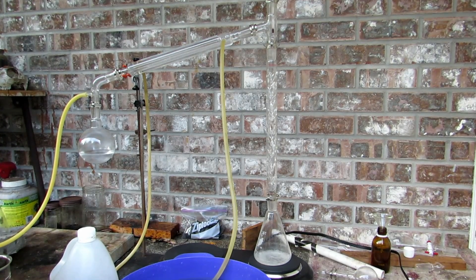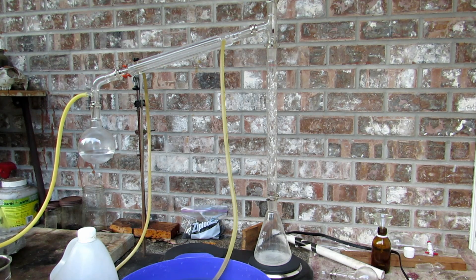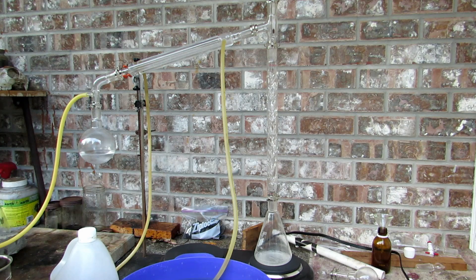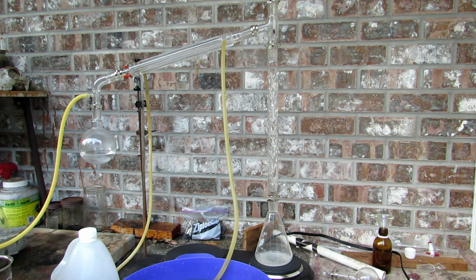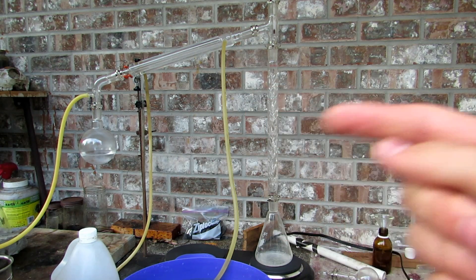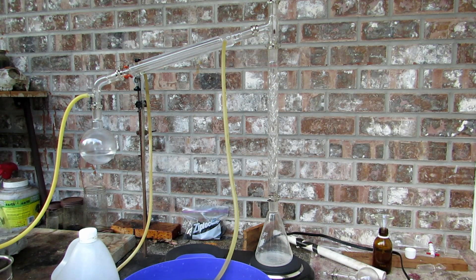As soon as everything settled at the bottom of that large jar, I simply decanted off the upper layer, saved the chloroform layer, transferred it to a separatory funnel, and separated it off. We are now distilling it — it boils at about 60 degrees Celsius and it's all coming over. I just have it running through a fractionating column and it's all collecting over there. There was some murky white stuff that came over at the start, and I just transferred that to a separate jar because that's impure.